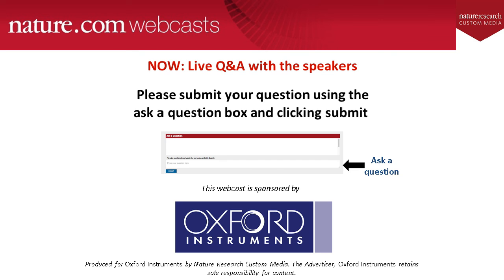The windowless detector does require a high vacuum. So if the instrument being used needs variable pressure quite regularly to image these samples, I would actually advise using one of our window detectors such as the Ultim 170, which still has sensitivity and is extremely fast, but the window will protect the detector.